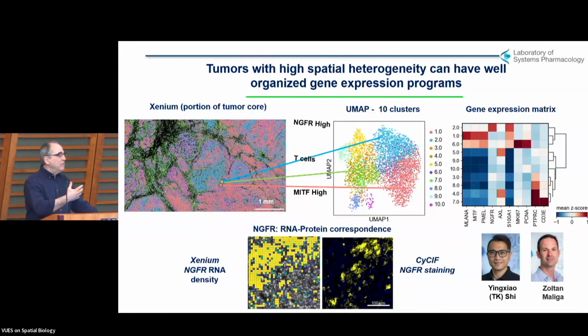proximity. And working out how to move back and forth between these two types of visualization, which is very much what Nils showed before, between sort of the data visualization and true 3D, and then the derived feature representation is a really big task. And Robert, for example, and others has built some tools to do that, but doing that in a facile way is still pretty challenging.